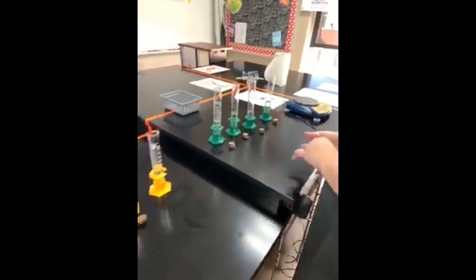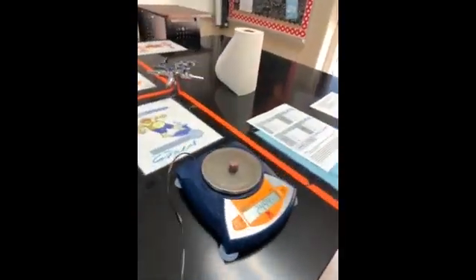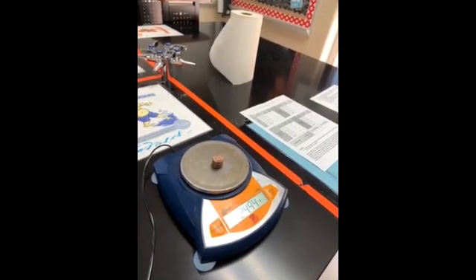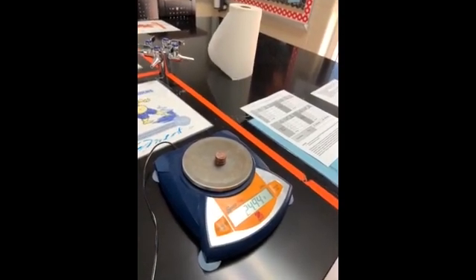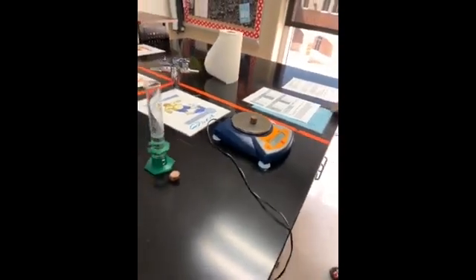Now let's go ahead and get our post-82 penny masses. Trial 1 for post-82. There we go for trial 1, post-82. Again, this is a stack of 10 pennies. Go ahead and write that down.